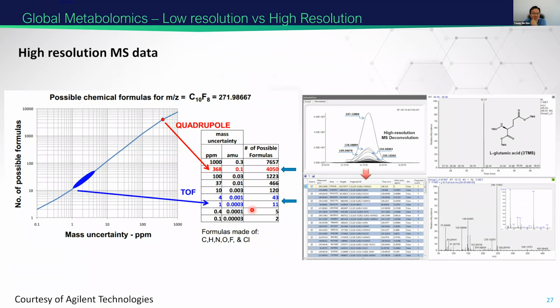Even more, if we use FTICR or a high-resolution Orbitrap, we can get more accurate m/z values, and that increases the probability of correct identification. Also on the GCMS side, we have an Orbitrap GCMS, and all the fragments are also acquired at higher resolution, so we can really increase the accuracy of identification if the metabolites are fragmented.